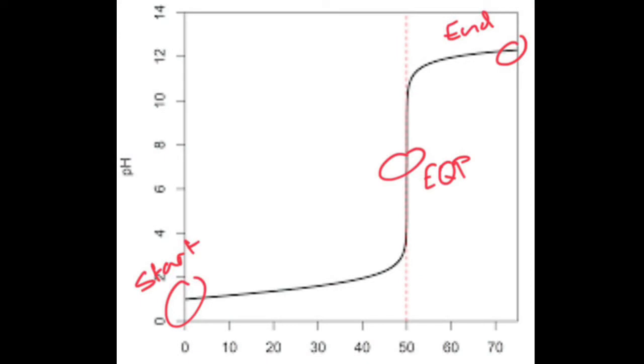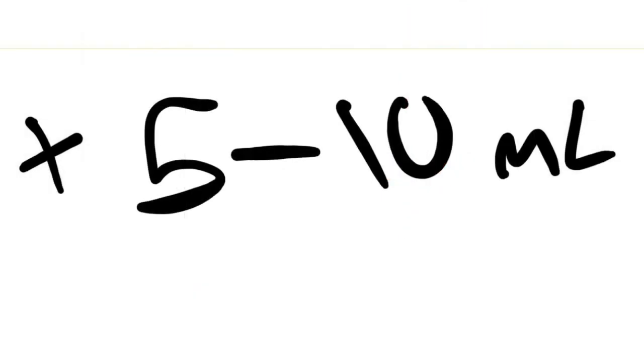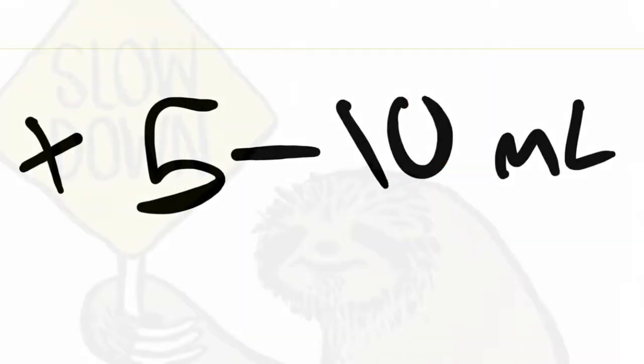Remember, you're trying to replicate a titration curve given to you, so looking at starting pH, equivalence point, and pH of endpoint will help you choose which chemicals to use. Also look at the volume of titrant added so you know just about how much to put into your burette, and then add a little more in order to give yourself more breathing room.